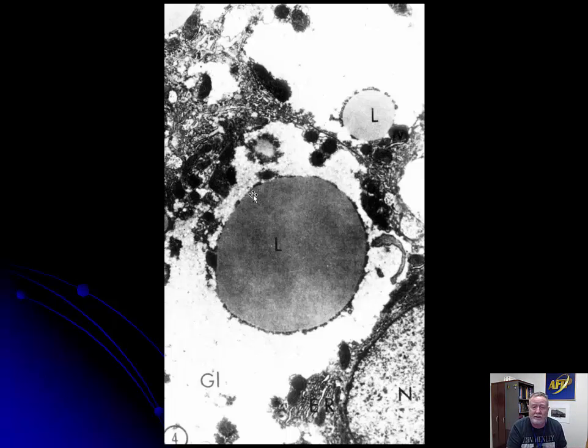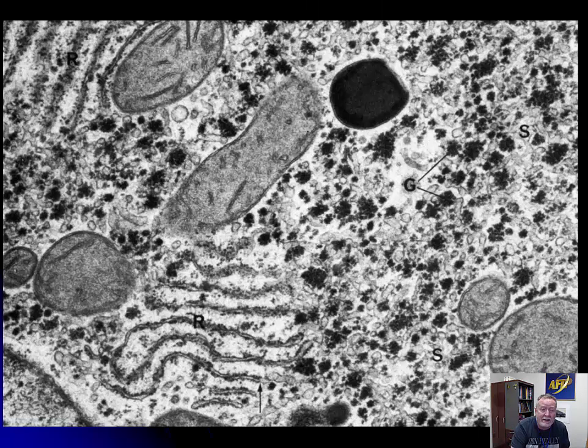We're going to use that later on too, that little bit of information. But it pushes everything else out of the way. This is a bunch of glycogen, which has just gotten pushed out of the way. It tends to just be sitting on the outside. So fat tends to push organelles, glycogen, everything out of the way, whether it is a clear looking hole, sort of grayish and variegated as this, or a dense black blob in this properly fixed specimen.